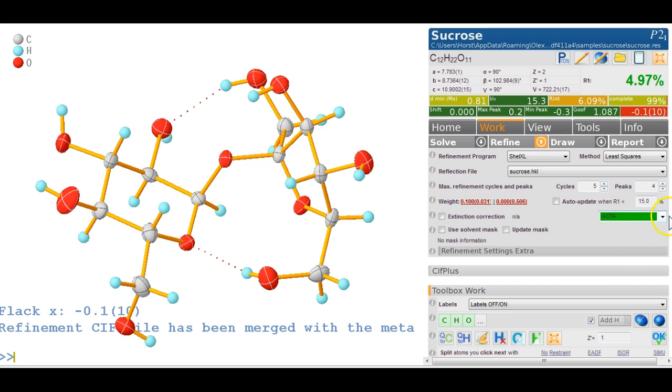The acta command is on, so we get a CIF file. There are other options here. You can have no acta, so the acta isn't shown. It will not give you a CIF file, or no HKL is produced. That's a slight thing. This goodness of fit is looking good, even though the weighting scheme isn't switched on.